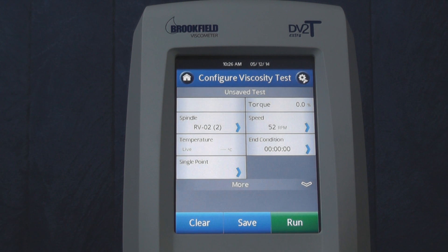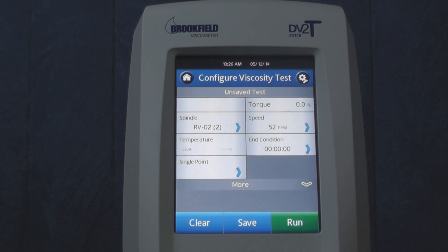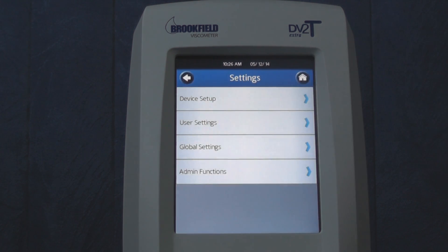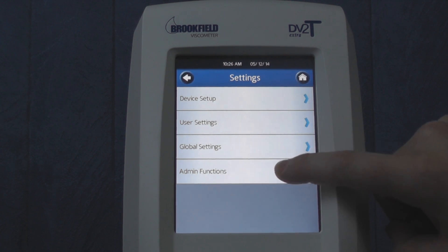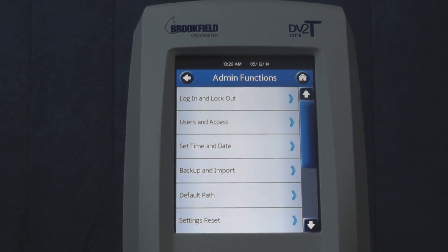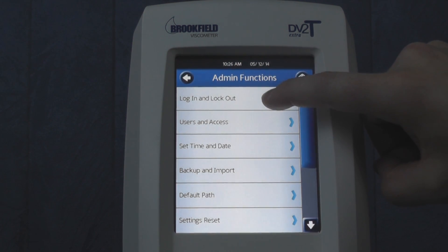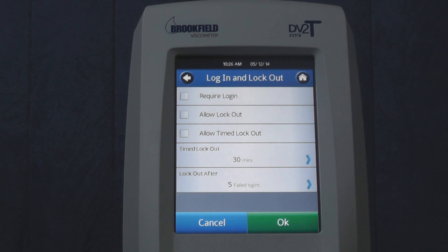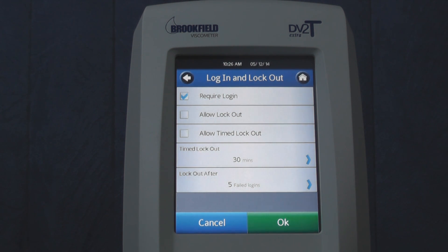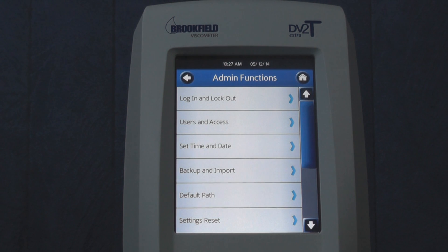Initially, the login requirement will be turned off, so you will not have to supply a username and password. To turn on the login requirement, first press the Settings icon in the top right corner, go to Admin Functions, and then Log In and Lock Out. Pressing the Require Login checkbox will force you to supply a username and password next time you log into the Viscometer. Pressing the OK button will save this change.